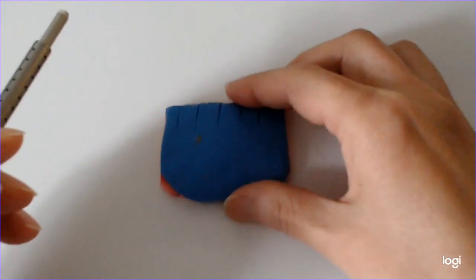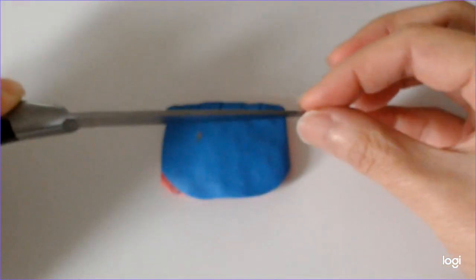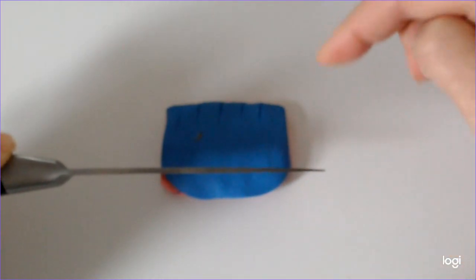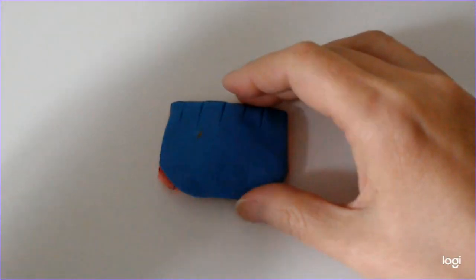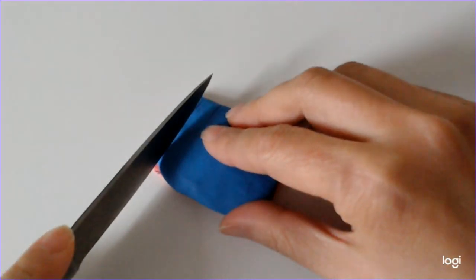Other pathologists may prefer to slice the specimen horizontally. With that approach, they can measure the lateral and medial margins, but not the superior or inferior margin. So this would be horizontal slicing, where you could measure these margins, but not this margin. My preference is to go for sagittal or vertical slicing, which I will do here.